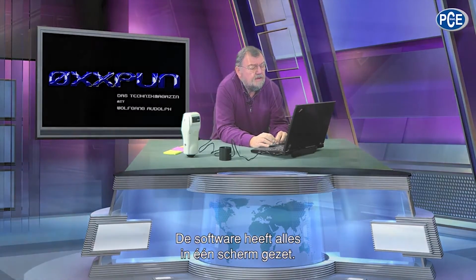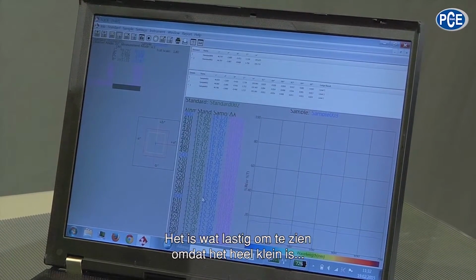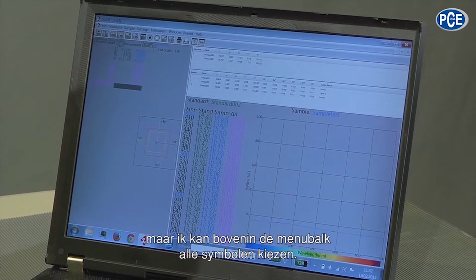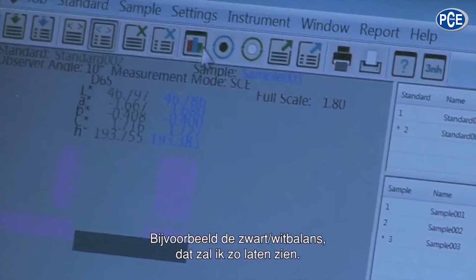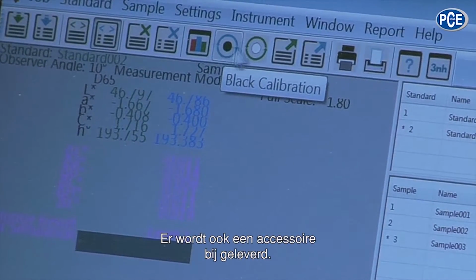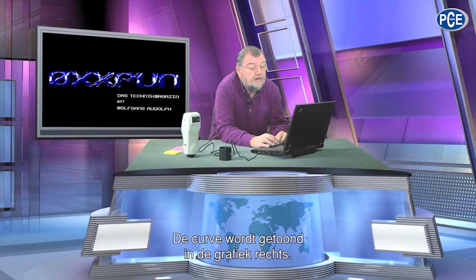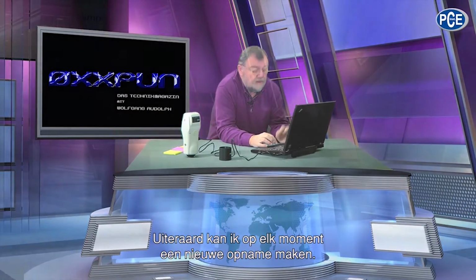The software has packed everything onto one screen. Now it's a bit difficult for the camera to see it because it is very small, but I can also at the top in the menu bar choose all the symbols. For example, the black and white balance. I'll show you that in a moment. There's also an accessory which is delivered with it. The curve is shown in the right hand side graph, and naturally I can record at any time a new recording.